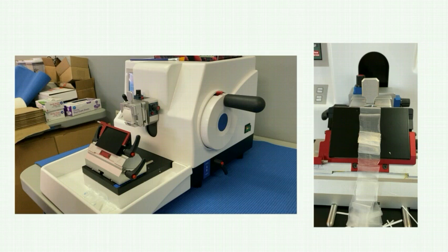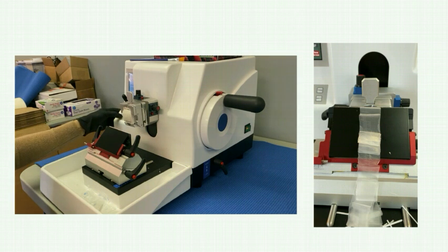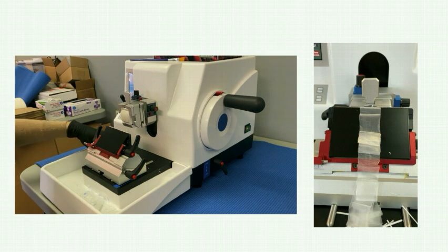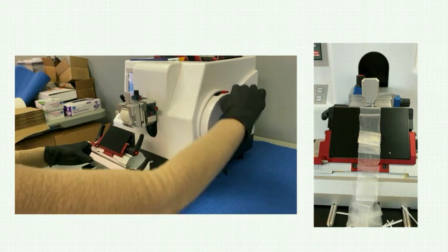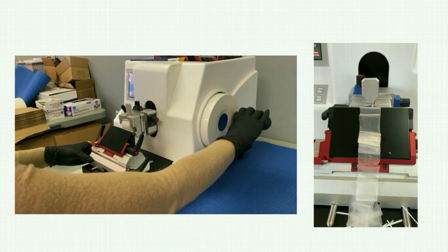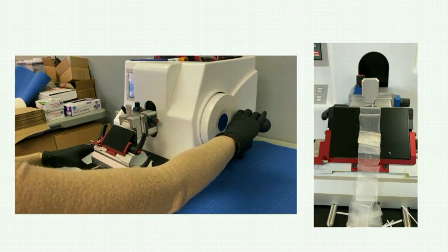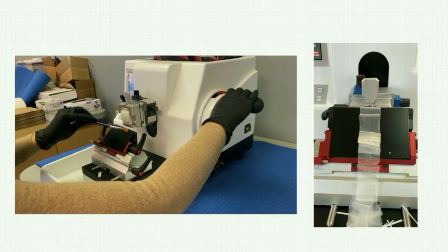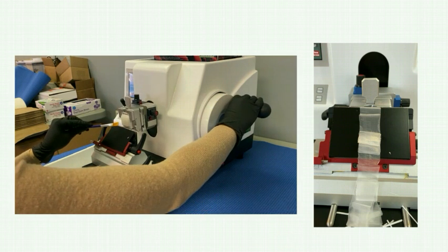Finally, here are a few videos showing you the setup and cutting of paraffin wax samples in cassettes. Here, in this video, I am beginning by advancing the specimen head containing my sample close to the cutting blade. To save time, I can move the knife block to reach closer to my sample. Once I am close, I begin turning the hand wheel until thicker slices are made during trimming mode. I can lock the hand wheel in place if I collect any slices.